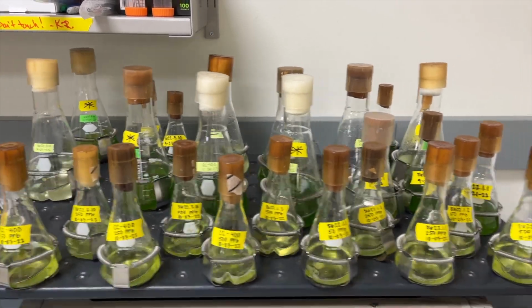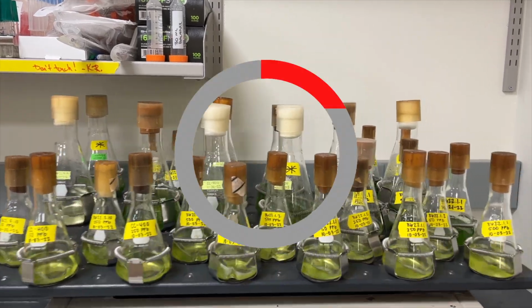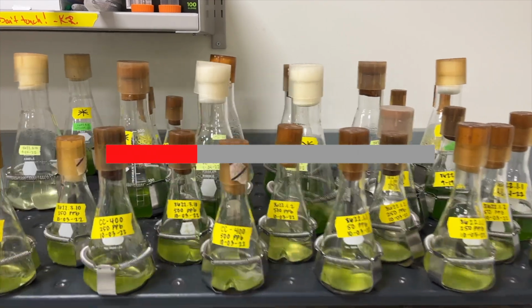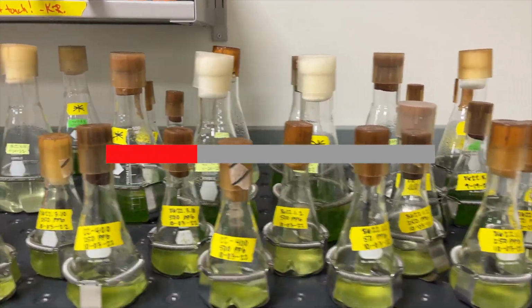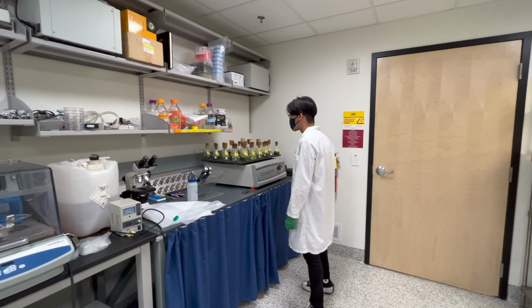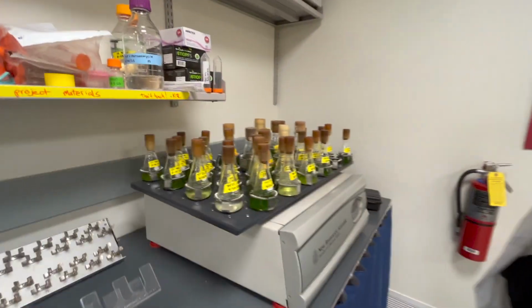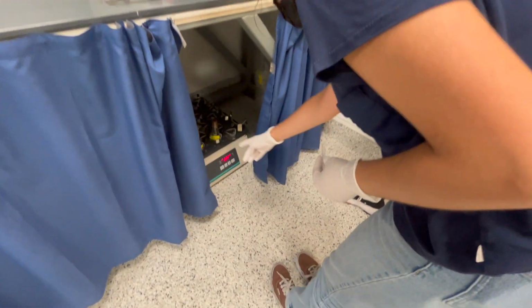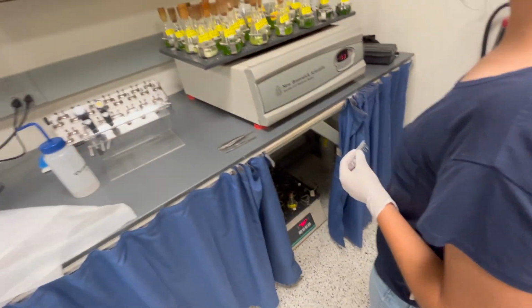Another unintentional factor that may reduce transformation efficiency is using circular DNA to transform rather than linearized DNA. Both approaches have the potential to result in transformants, but our team saw much success when using a linearized plasmid. Additionally, ensuring that the C. reinhardtii cells have adequate time to recover post-transformation is also incredibly important. Some protocols do not use a 24-hour dark recovery period, but our team had very little success in transformations that were plated without recovery.